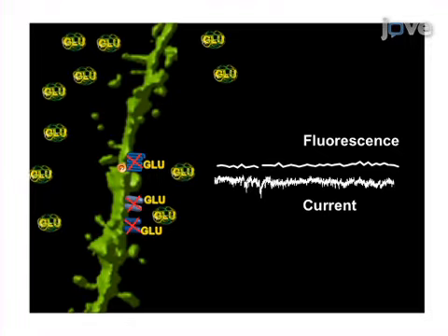intracellular sodium signals. This method provides a reliable tool for the investigation of intracellular sodium signals in small cellular compartments and in intact brain tissue.